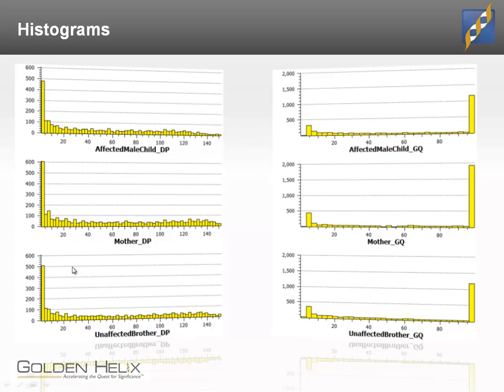So I produced these histograms in SVS. If you wanted to get to these histograms yourself, they're actually extremely easy to reproduce. And in fact, what we did is we turned all the steps from this webinar into a tutorial form. That tutorial went live today. You can find it from our website. You can step through the steps and see how we performed everything click by click.